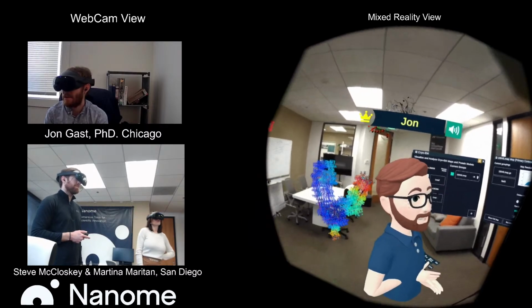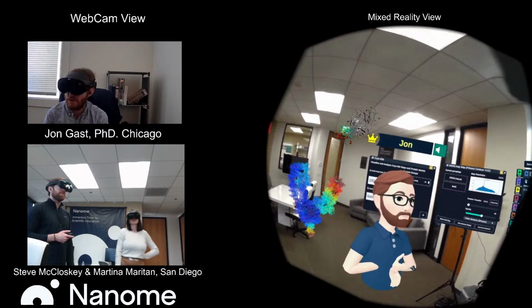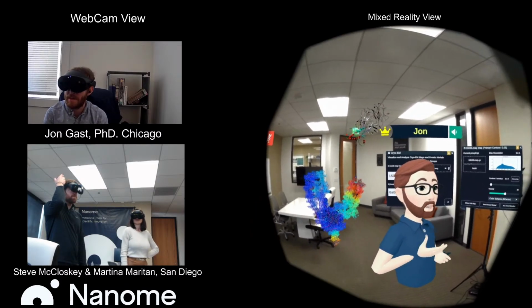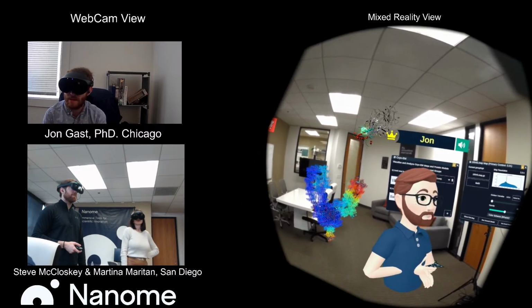So even with things that are absolutely enormous, like ribosomes or adenoviruses, being able to look at the spaces that you're most concerned with, a bit at a time, or a protein at a time, or a few of them at a time, is something that you can manage.